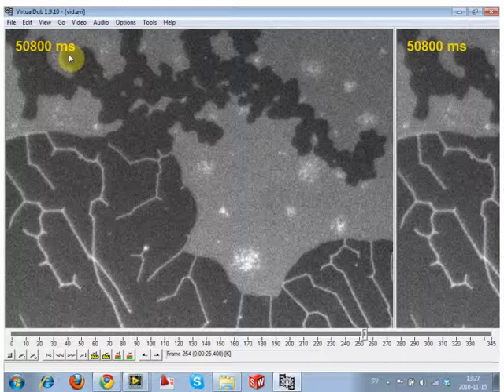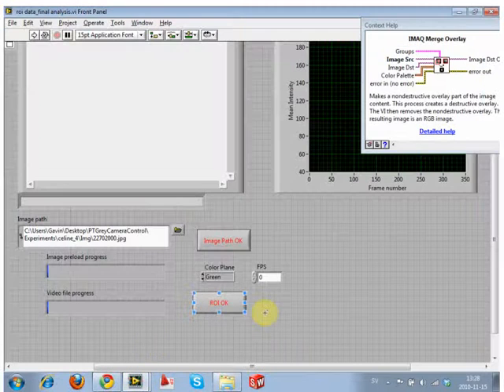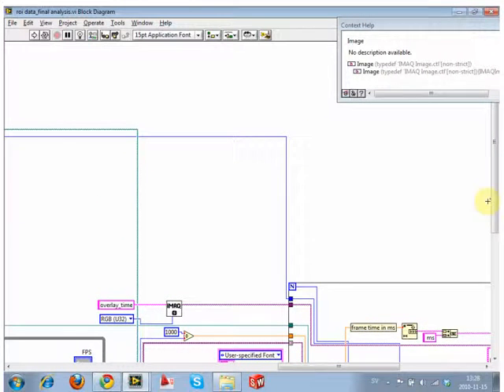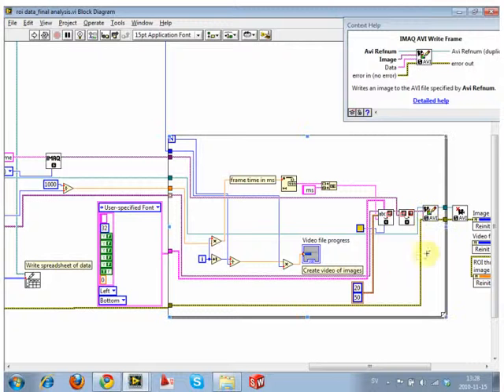Sometimes there would be a desire to have all of the frames for this outputted. This is just to let you know that there's something you can do, but most of the time it's not worth it. We can write each one of these newly made frames and save them as files too. But because we're not doing any manipulation to the video type, it's essentially a big stack of bitmap files. These are pixel information. There's no JPEG smoothing, no compression factors or anything. We can add all of that, it's just a feature of this one. We can change it and put in different compression filters, etc. Actually, you need to do it at the start.